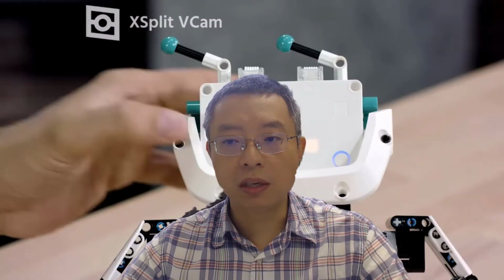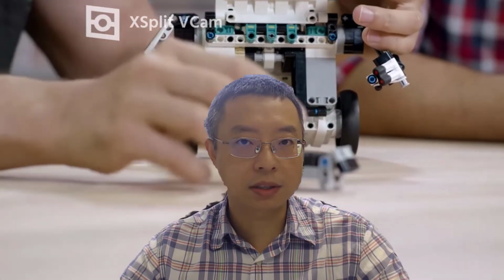For example, in physical chemistry research, you're going to use many instruments for measurement and controlling. But very often it requires some kind of tweaking and customization for your task, right? Just buying the instrument itself is not going to do it. So there are really two ways of solving this instrument controlling problem. The first way is simple. You just buy an integrated system, as a large instrument, and all the programs have been written by the manufacturers. Or you can customize your own instrument by connecting multiple small instruments with your code and control them. So the first option is obviously simpler. However, you lose all the flexibility, and in many cases it's not the best solution. Also, the cost is much higher compared with the small pieces of instrument you add together.